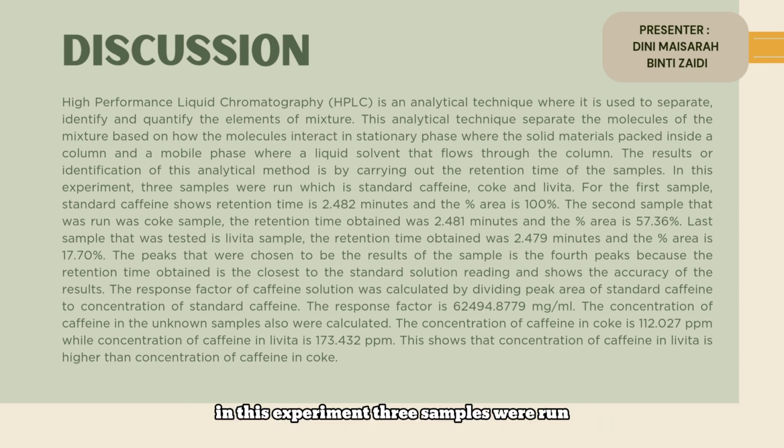In this experiment, 3 samples were run: standard caffeine, Coke, and Levita. For the first sample, standard caffeine shows a retention time of 2.482 minutes and the percent area is 100%. The second sample was the Coke sample. The retention time obtained was 2.481 minutes and the percent area is 57.36%. The last sample tested was the Levita sample. The retention time obtained was 2.479 minutes and the percent area is 17.70%.